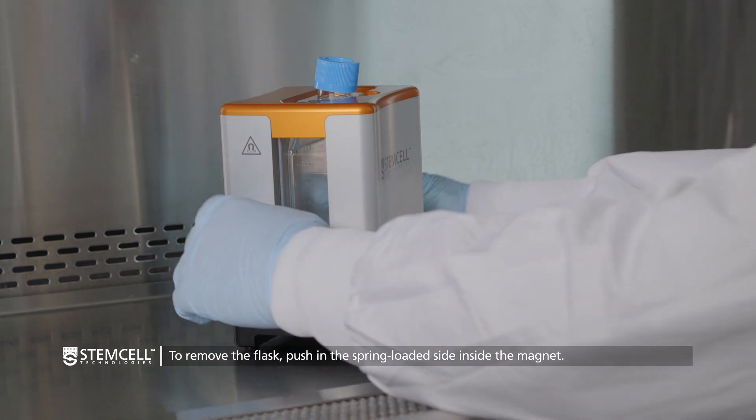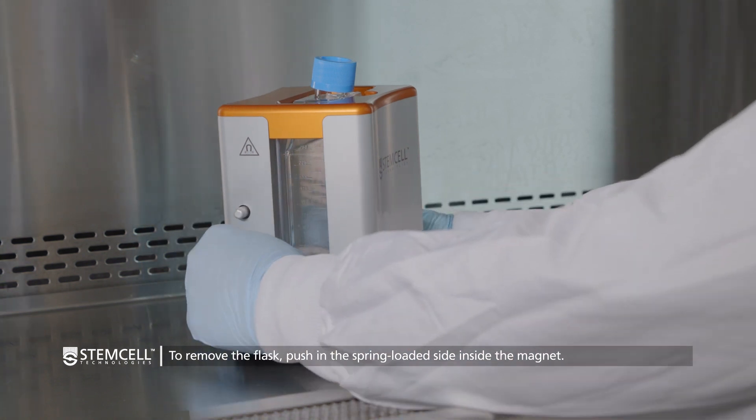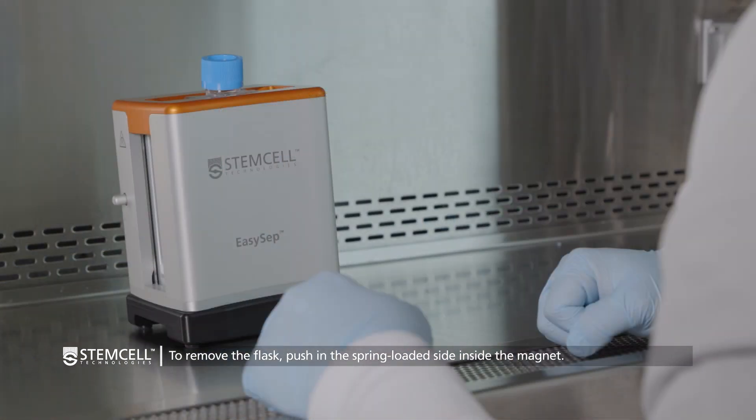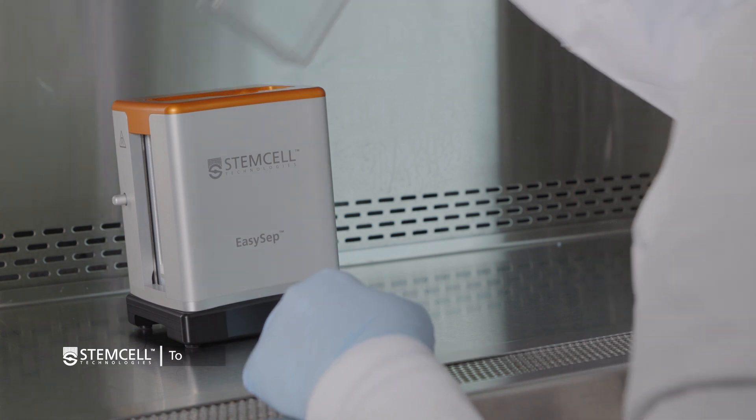To remove the T75 flask from the magnet, push in the spring-loaded side inside the magnet. You can now safely retrieve the flask.